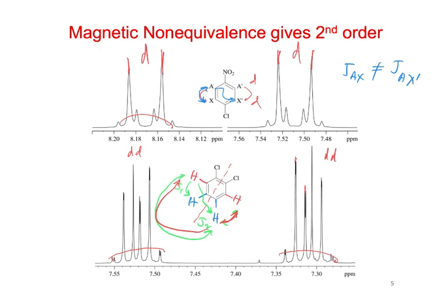Can you increase the magnetic strength? No, that's used. Well, I think if anything, that would reduce any second order effects, if we go down the other way. I frequently get it backwards. Well, yeah, look at this one. So this is showing like a splitting there, but it doesn't match the coupling constants over here, right?